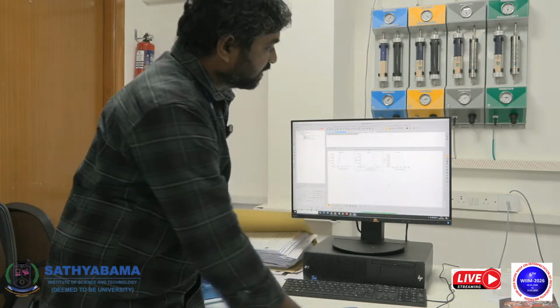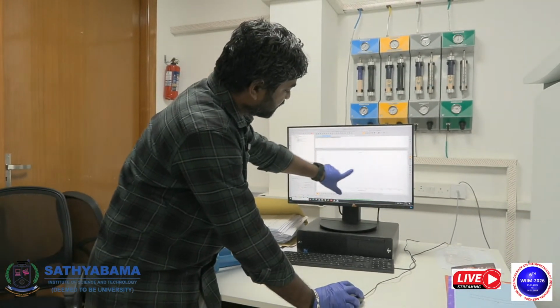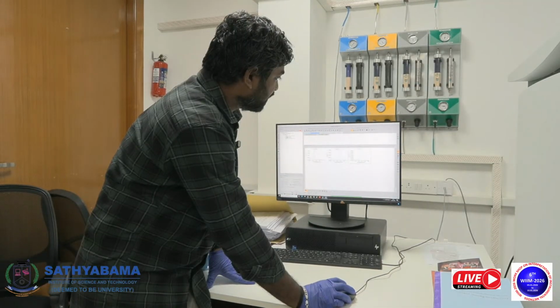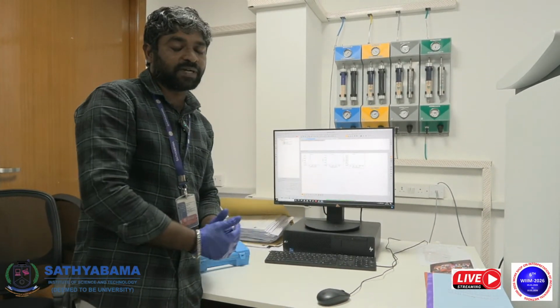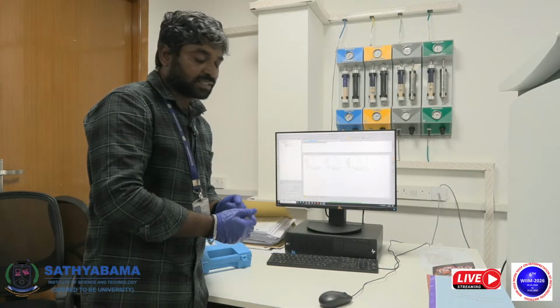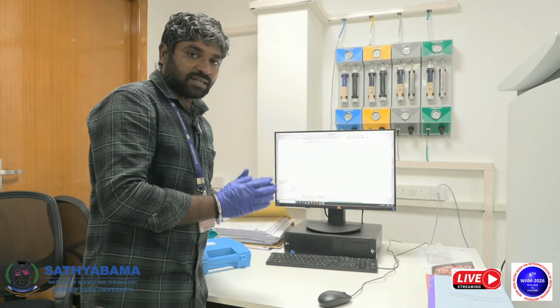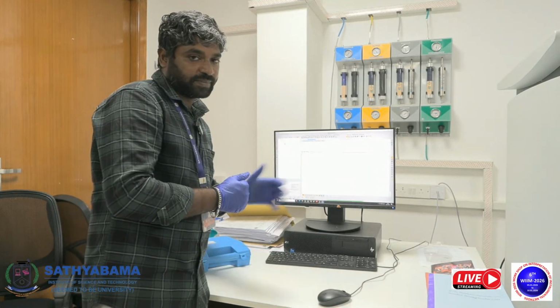And here this is the spectrum of oxygen. So now we have got the oxygen pattern. This is convoluted data, and here the resolution is 0.7 electron volt. This is the convoluted data, so you have to do the deconvolution process. Once you do the deconvolution process, then you will find what chemical bonding happens in your material.